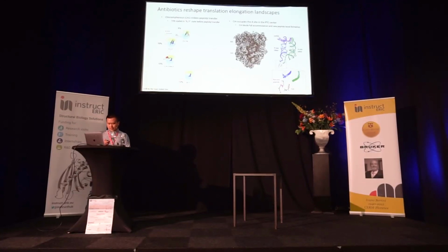Also, for this state, we are able to directly visualize this chloramphenicol density right in the A-site tRNA, and in this way it actually blocks the formation of the new peptide bond. You can see there is quite a strong density that connects to the P-site tRNA of the nascent peptide. So the incoming amino acids cannot form a new peptide bond.